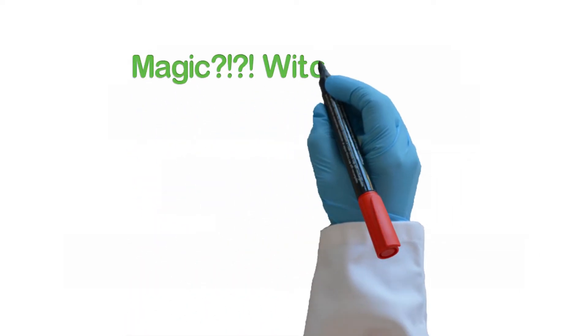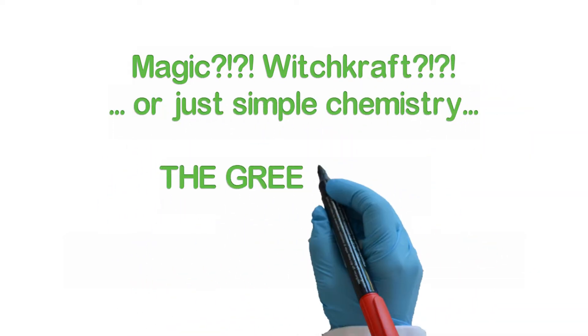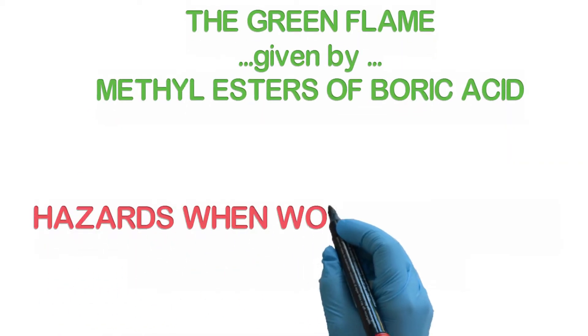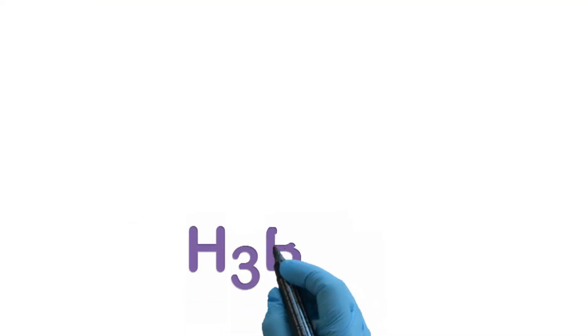Experiment number 92. A very versatile experiment, as it combines information from esters with the ones from the flame reaction and alcohol burning capacity, is the synthesis of methylated boric esters.